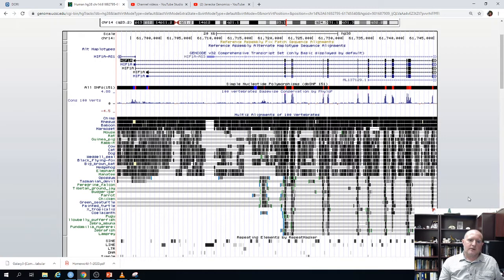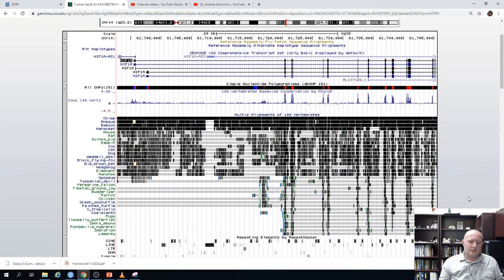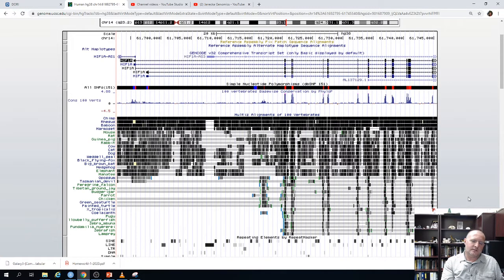Interestingly, fugu and the pufferfish appear to be missing that very last exon found in humans, and so does the lamprey. This gives you a lot of information on the evolution of the gene and how conserved it is. The more conserved the gene, the better the inference you get from using model organisms to study it. For example, if in the mouse a gene is very divergent and doesn't have the same exons, information from mouse trials on potential drugs or therapeutics interacting with this gene might not be directly translatable to the human.